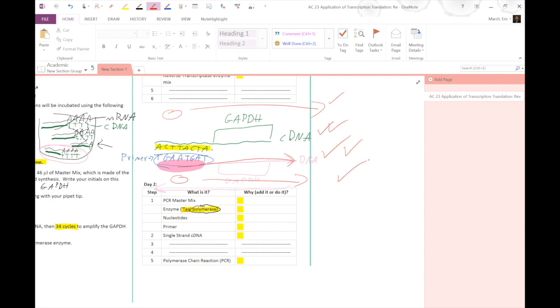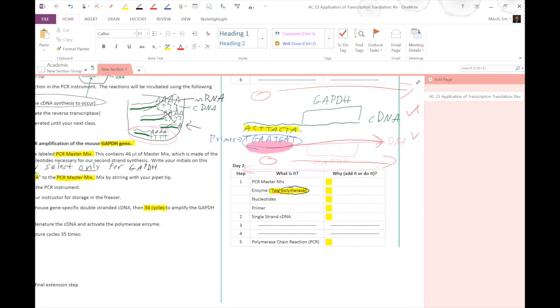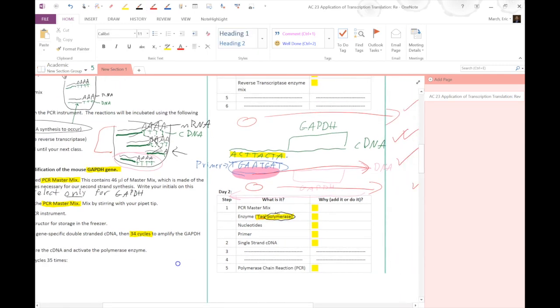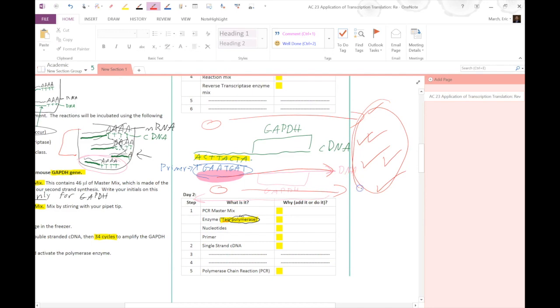So after a few cycles, after 7 or 8 cycles, we will have millions and millions of copies of our DNA strand. All of this original stuff, and this is very important, all of this original stuff is still in the test tube. We do not destroy it, and it does not go away. But when we run it on a gel on day 3, there might only be 1 or 2 strands in there, and the gel is not sensitive enough to pick that up, so we won't see it. What will show up, though, is these millions and millions and millions of copies of just the GAPDH gene. And that's what we're going for, and that will be day 3.